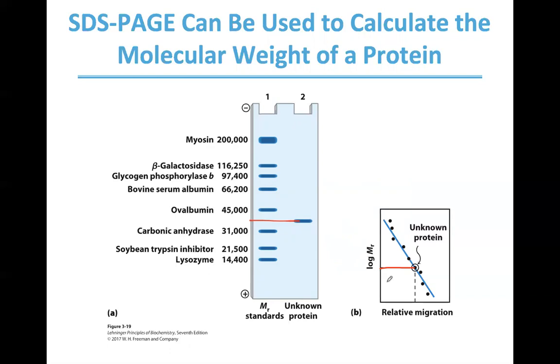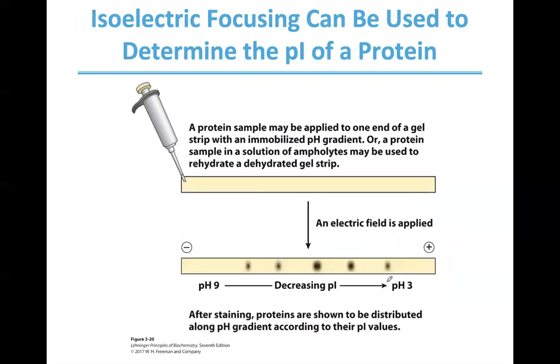Just a couple more minutes, guys. There's one other technique I want to briefly discuss, very useful, used for purification of proteins from a very large quantity of other proteins, thousands of other proteins. It's known as a combination of isoelectric focusing and electrophoresis.